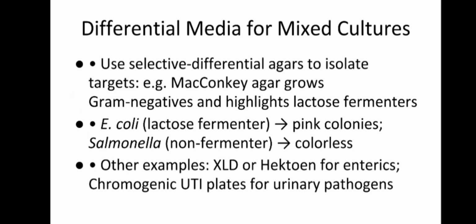Okay, in mixed samples like stool that you usually get from the laboratory, MacConkey agar is invaluable because why? It inhibits gram positive and turns pink if lactose is fermented. Okay, we have seen E. coli from fecal culture as hot pink colonies.